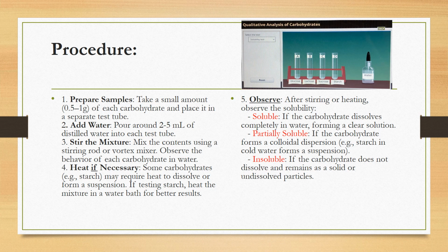Then observe the behavior of each carbohydrate in water while you are mixing, or after you mix them all. Heat if necessary. That means some of these samples need heating, but not all of them. Which one needs heating?